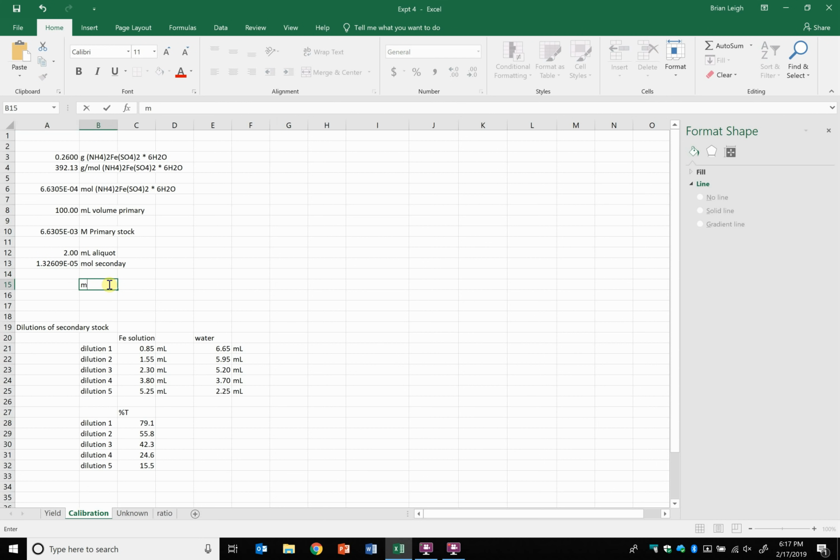Okay, so what was the size of that secondary stock? That size was 50 mLs, right?